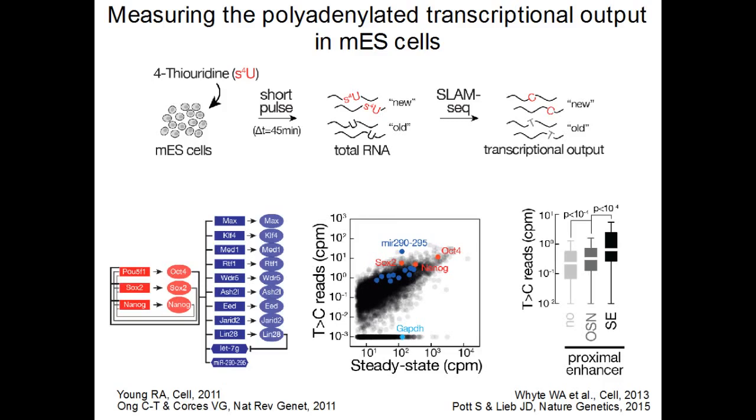A subset of enhancers in mouse embryonic stem cells were previously described to form arrays of concatenated regulatory elements, also known as super enhancers or strong enhancers, here labeled as SE, with unusually strong accumulation of transcriptional co-activators, specifically Mediator. In fact, around 150 genes in the proximity of such strong enhancers exhibited the highest transcriptional output, significantly offset from typical enhancers in our SLAM-seq measurements.